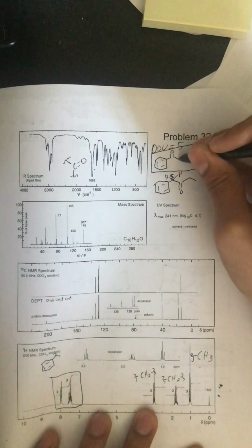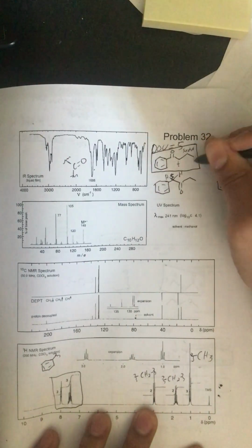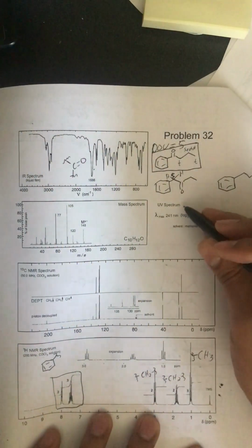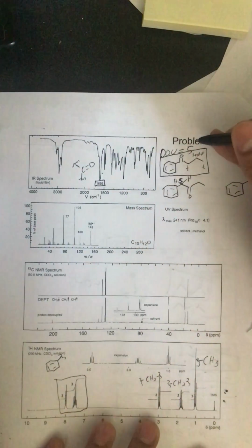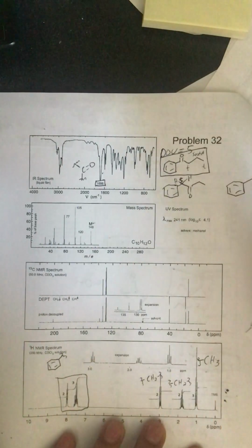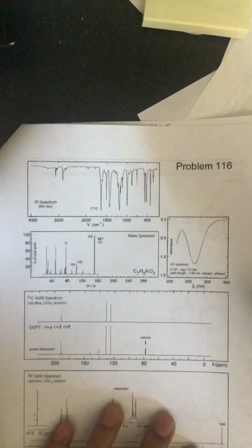And again, of course, this should be a triplet, this should be a sextet, and this should be a triplet. And you see it goes triplet, sextet, triplet. So then, in fact, all the data does match with this. This IR peak being below 1700 is because this ketone's conjugated to the benzene ring. I think we'll probably talk about that more in lecture as time comes on. But I'm going to move to the next problem.